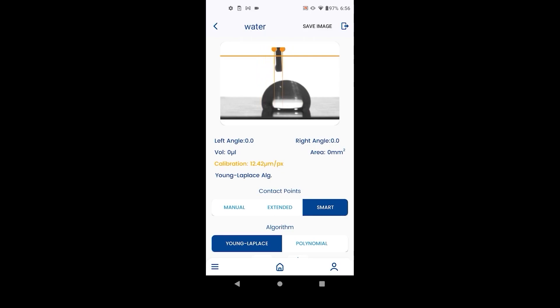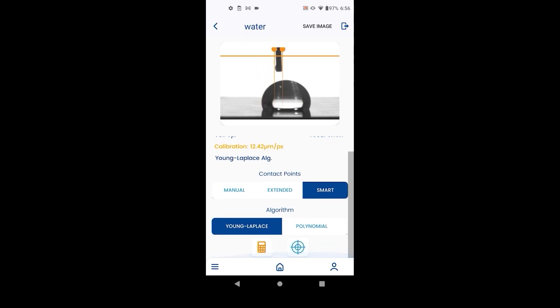To calibrate, move the orange points to the left and right of the needle and hit calibrate. An initial estimate is enough. If the calibration number is green then the number is correct.